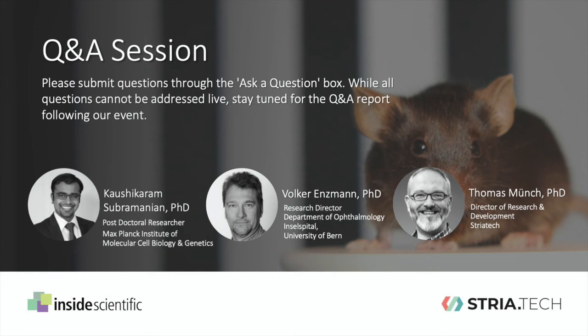Yes, under normal circumstances, they are comparable, as I just mentioned in my talk. But I would like to add a quick explanation of that. The optokinetic reflex, or the OKR, refers to compensatory eye movements, while the optomotor reflex, or OMR, refers to compensatory head movements. However, if the ocular muscles involved in the OKR are degenerated, the compensatory eye movement could be different from the head movement.